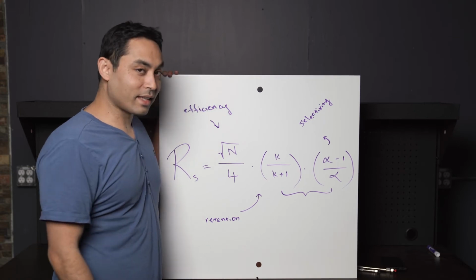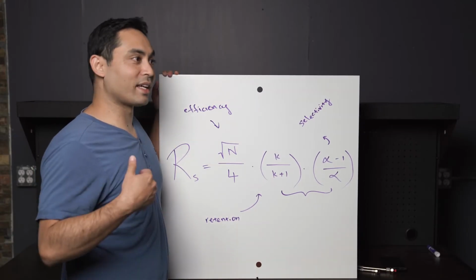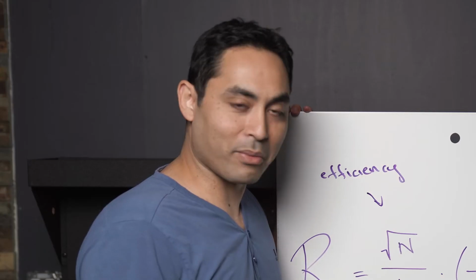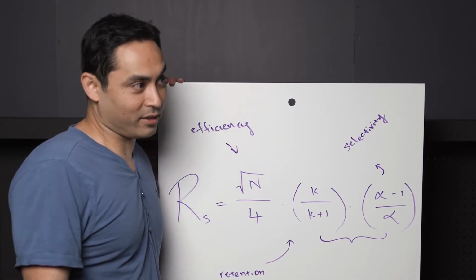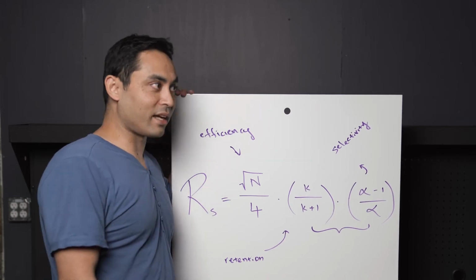When you choose a column with a smaller particle size, there are things you aren't quite thinking about. One thing is that sucker clogs way more often. You clog the column even though you're getting half the runtime. If your instrument shuts down overnight, then what was the point of that? Or you're throwing out more columns because they're clogging more often. Now you've greatly increased your cost, right? You're trying to save solvent, but now you're chucking more columns.